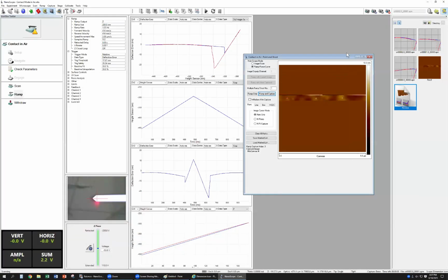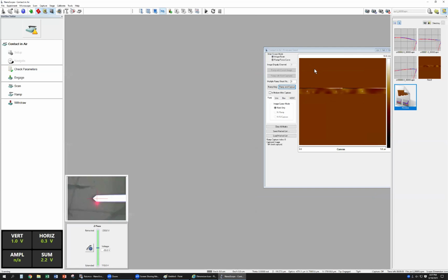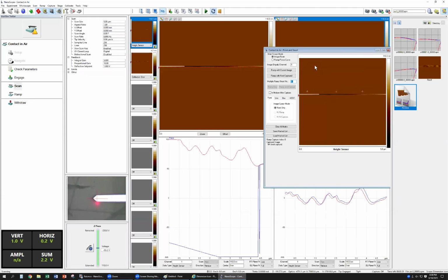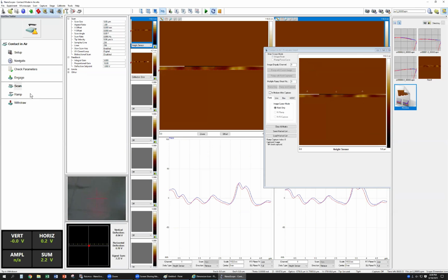In the contact module, after you finish, you can go back to scan. In the point and shoot window, you must go back to the image scan first, before you withdraw. Okay, so this one is in the contact module. The image is a little difficult, right?